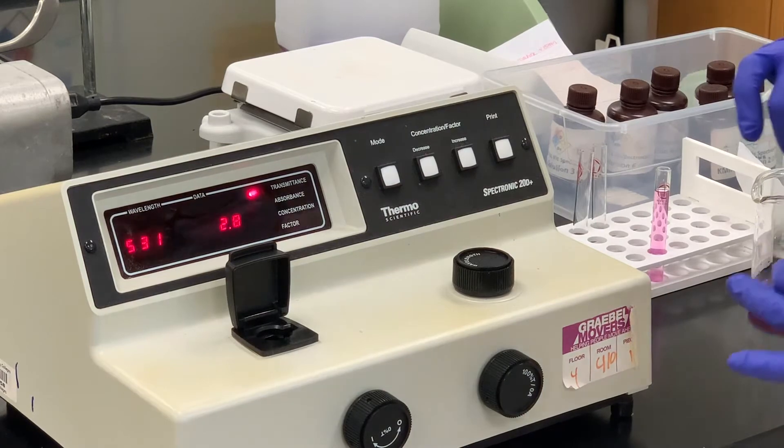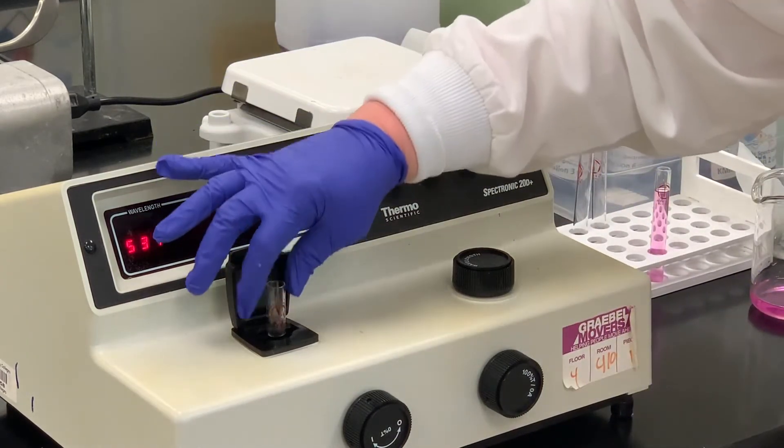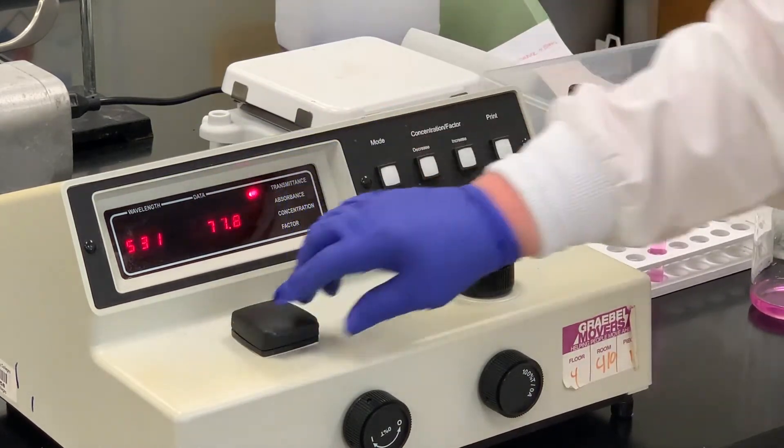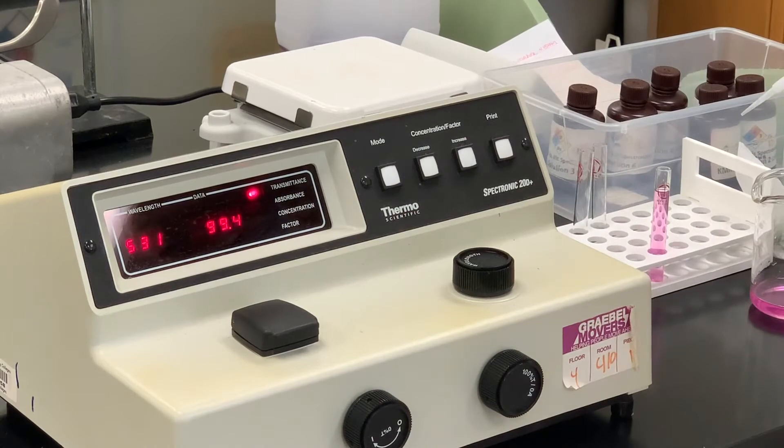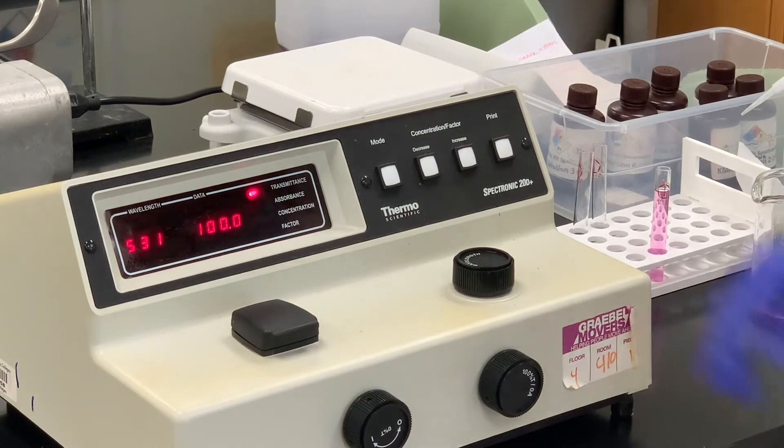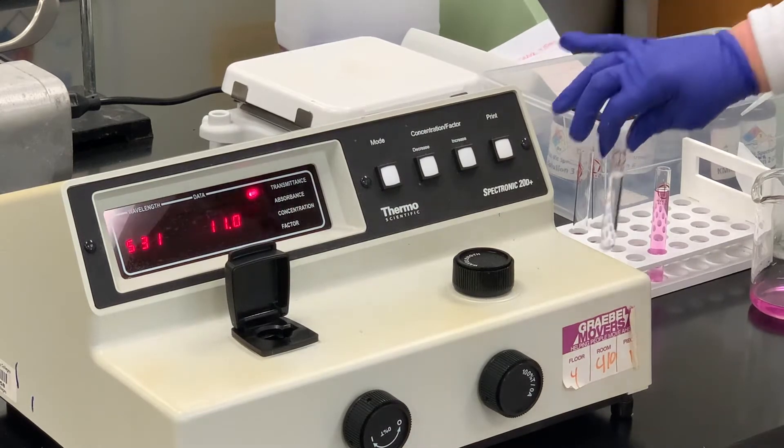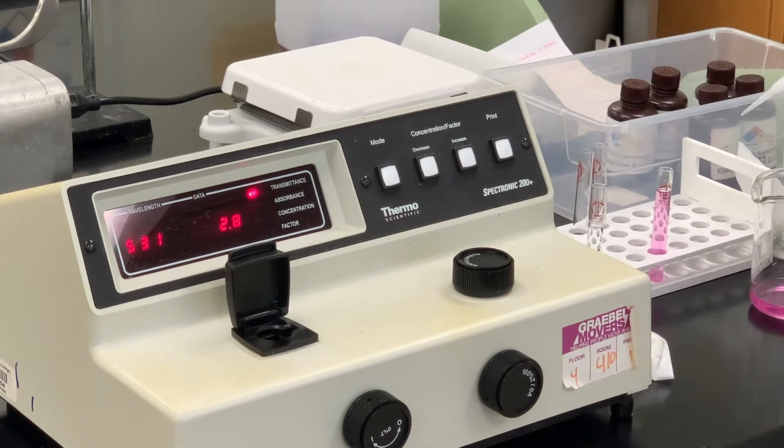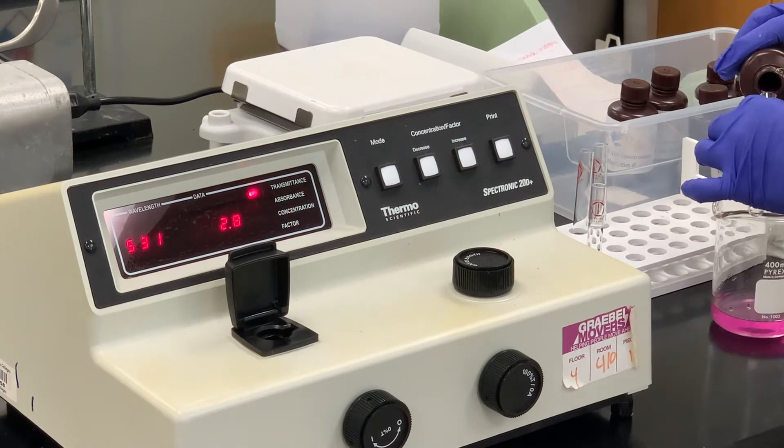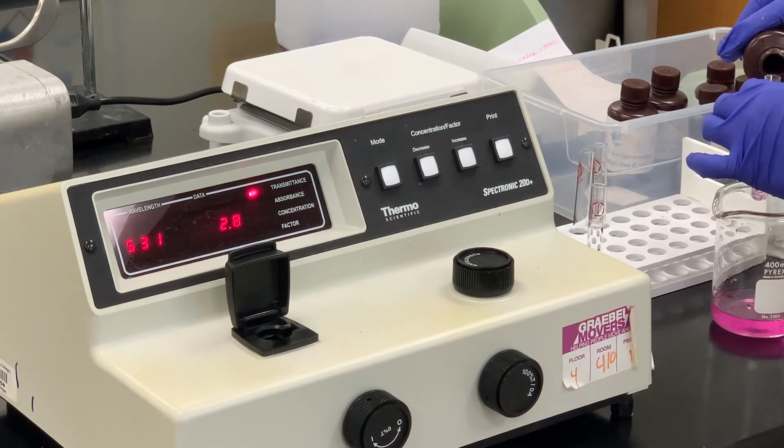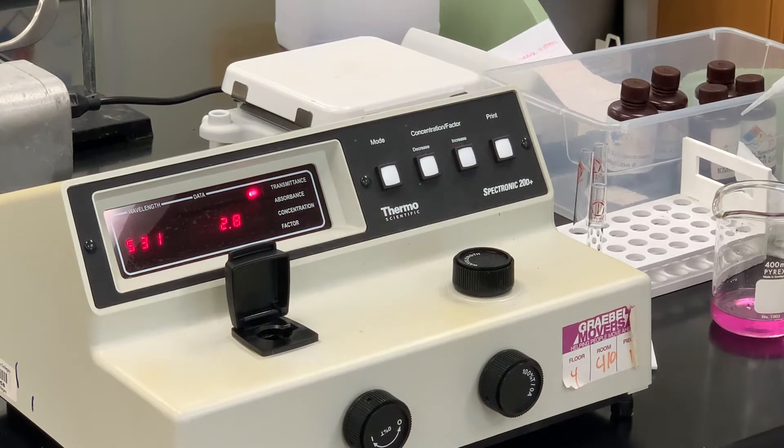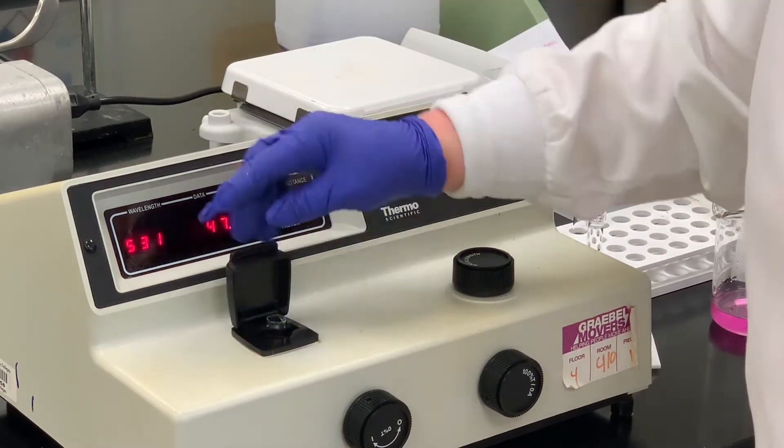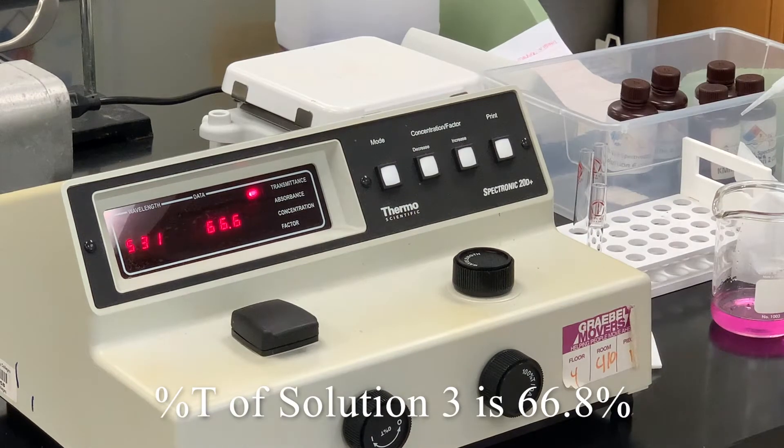Again, I'm just going to go back and make sure we're still at a hundred percent. There should not be much variation there. And now I'm going to use solution three, emptying solution two into a beaker and then rinsing that cuvette three times with the contents for solution three. And solution three is 66.8.